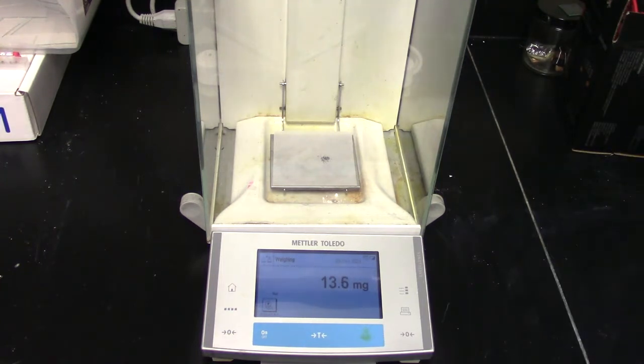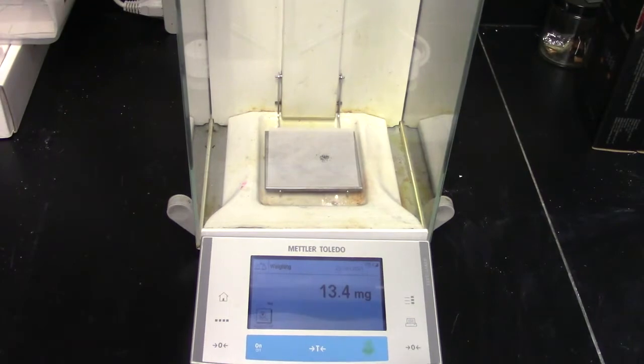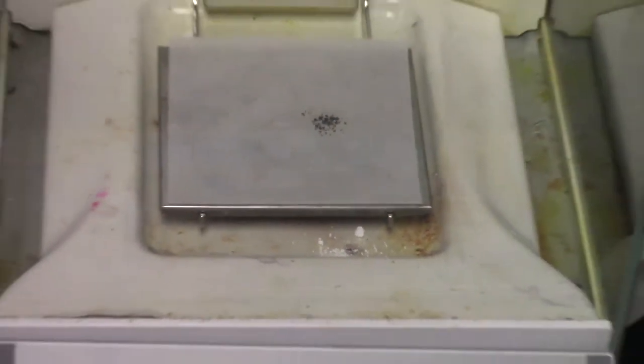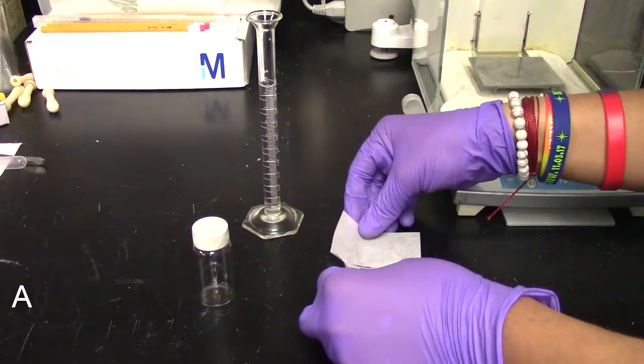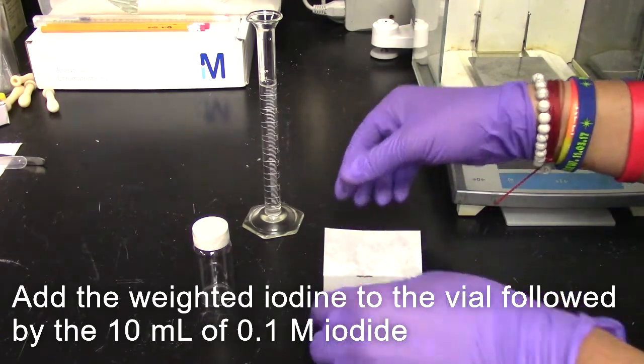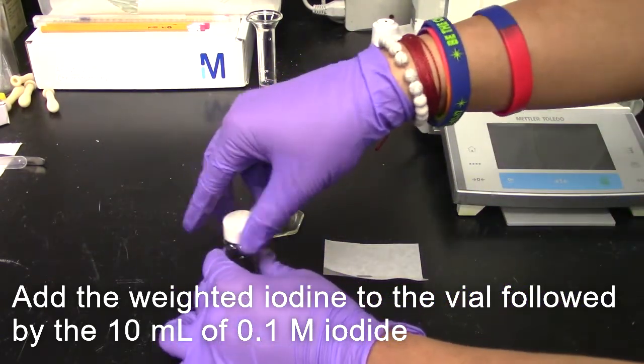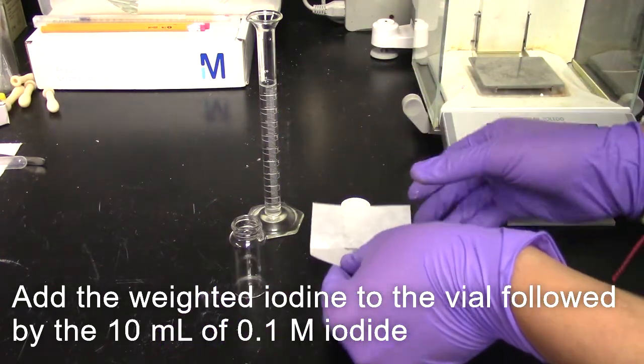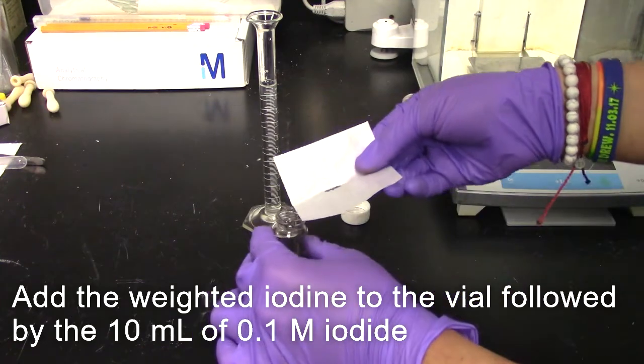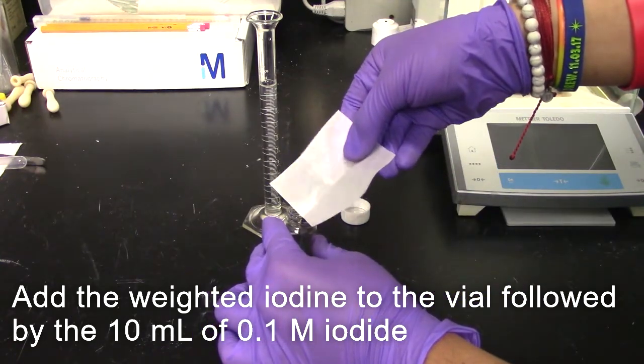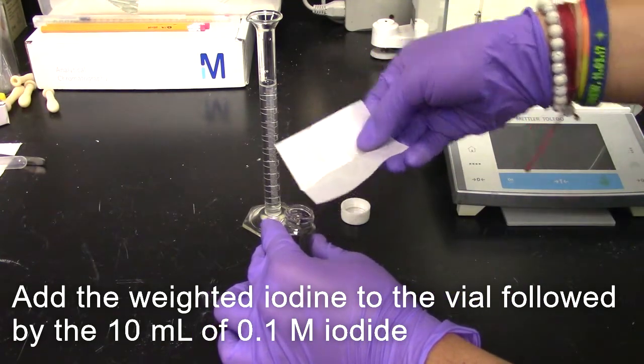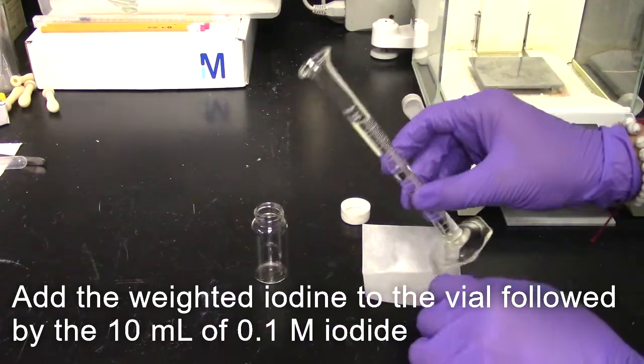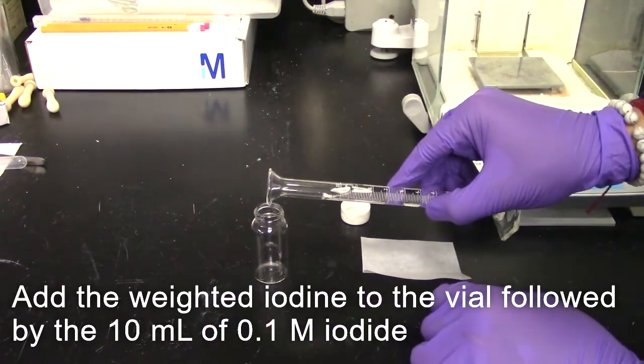Once again, having a few extra milligrams of iodine crystal will not affect the electrolyte solution. Now add the iodine crystal to a vial followed by 10 milliliters of the 0.1 molar iodide solution. Be careful when adding the pure iodine for it is a very small amount.